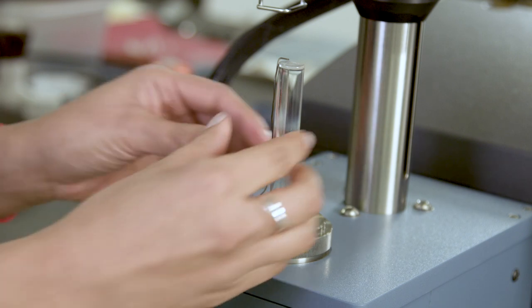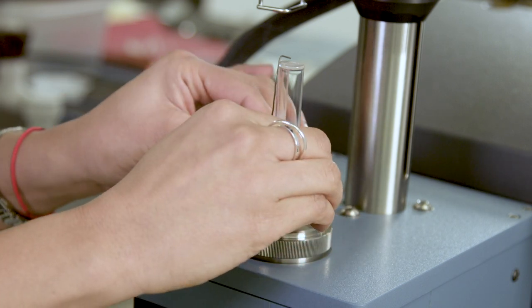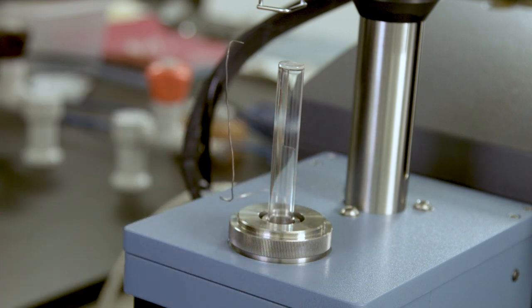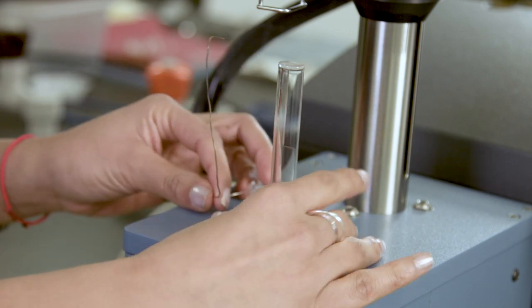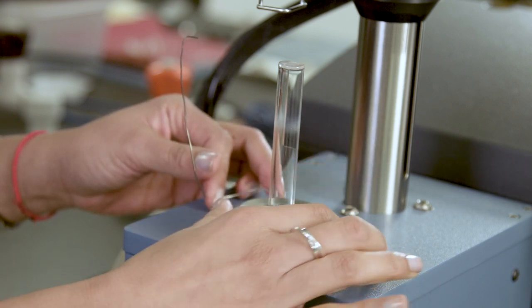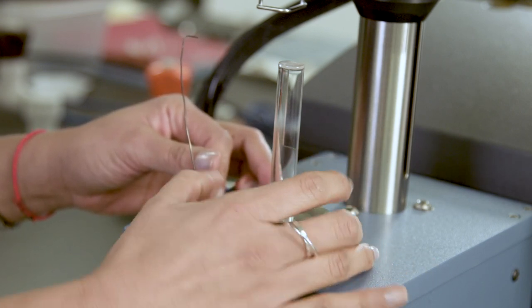Take off the spring clip that holds the sample thermocouple in place. Move the thermocouple off to the side. Unscrew the large stage nut counterclockwise and lift it straight up.